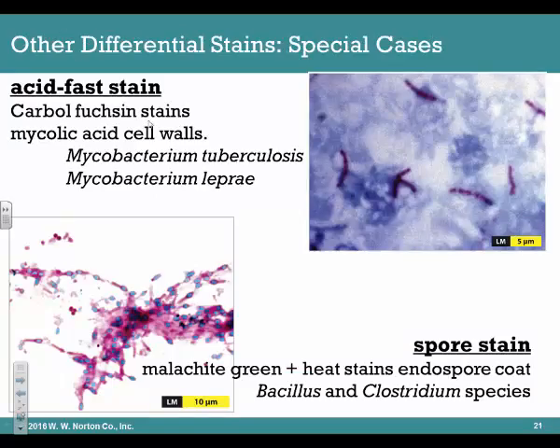There are other stains because not every bacterium Gram stains. So, for example, Mycobacterium, in addition to their cell wall, have this very resistant waxy coat of mycolic acids on the very outside of their surface, and it's very hard for really anything to penetrate that mycolic acid layer.